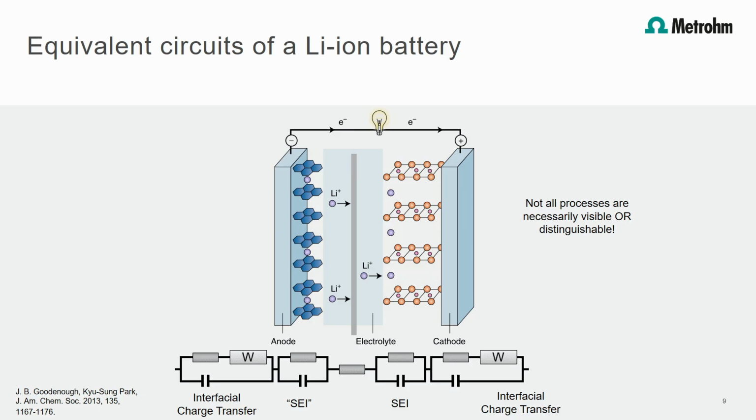By using the fit function in the evaluation software, the value of each used element will be determined. So the researcher will get values of the resistances of the SEI layer, resistance of the battery electrolyte, kinetic information via the charge transfer resistance, and so on.